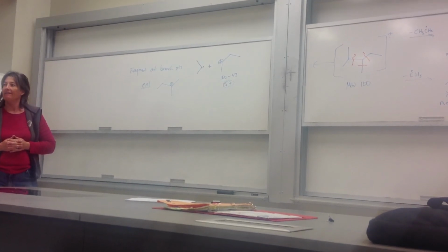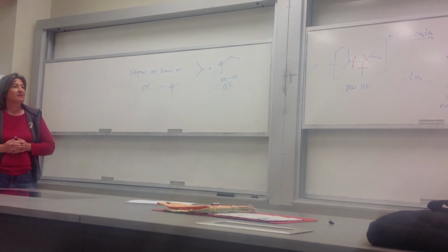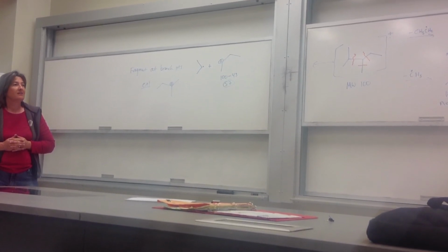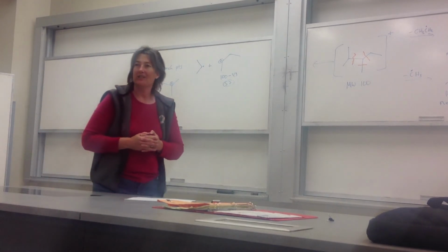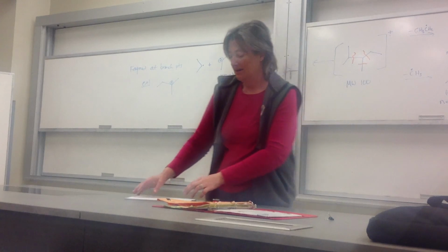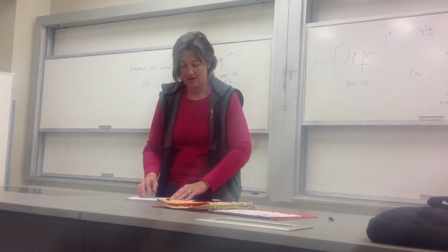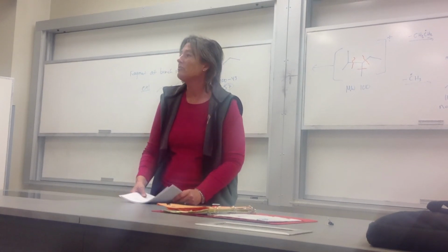Okay? The thing at 29, what's that? It's an ethyl. It's the ethyl coming off as a plus. Not as prevalent, it's just not as stable. All right. Questions on branch?